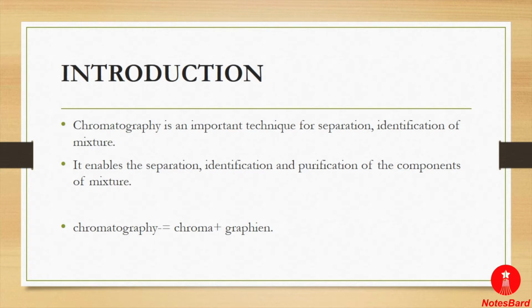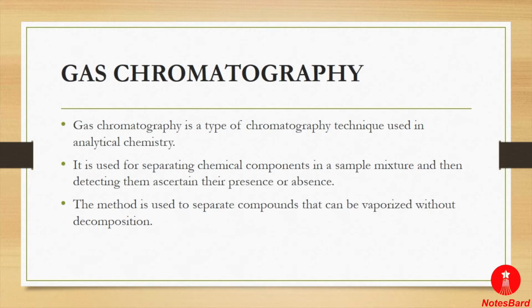Chromatography is of different types, which are named column chromatography, paper chromatography, adsorption chromatography, gas chromatography, affinity chromatography, thin layer chromatography and many others. In this video lecture, we will discuss gas chromatography in detail. So let's start with the introduction to gas chromatography.